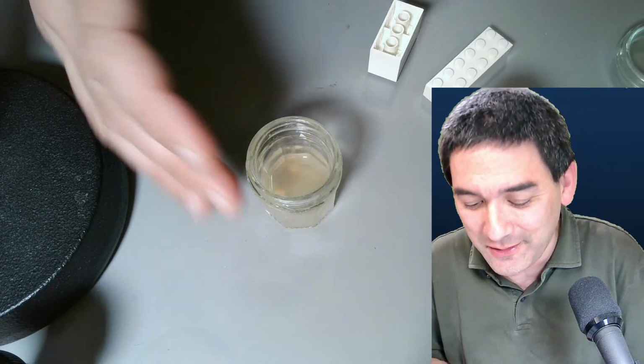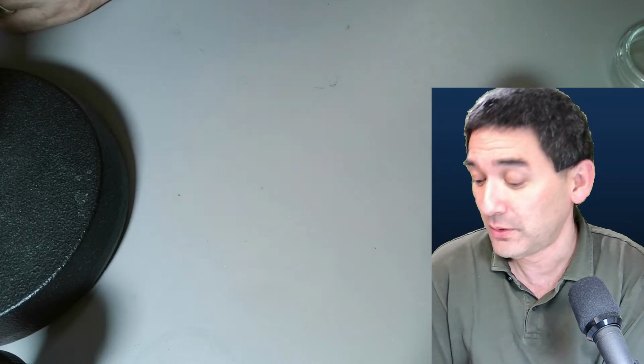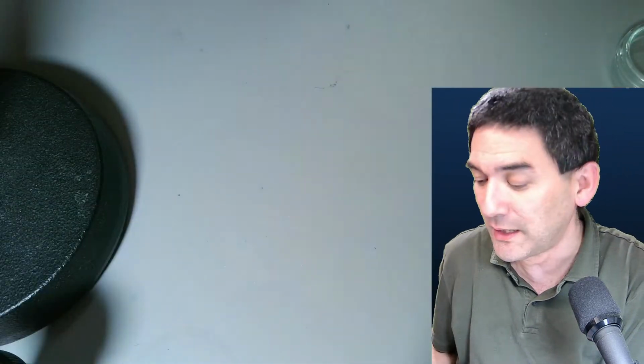I'm still saying you've got to be reasonably respectful. As a matter of fact, if you want to grow unknown bacteria at home on a petri dish, I do not recommend that. You're automatically in an elevated biohazard category number 2. That's something that only authorized labs are allowed to do.